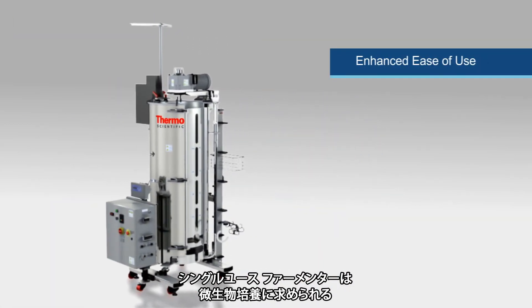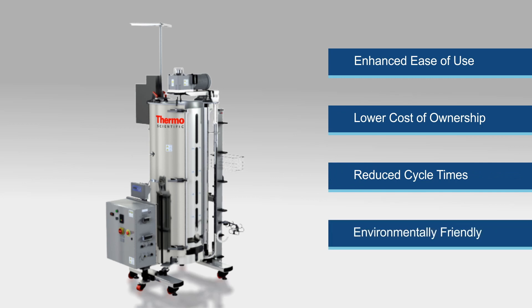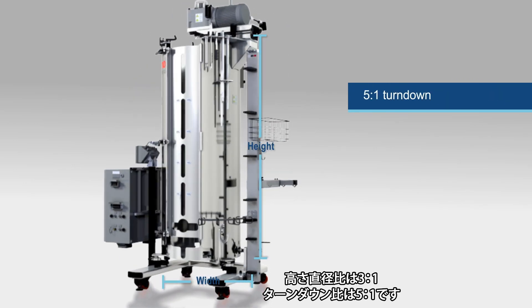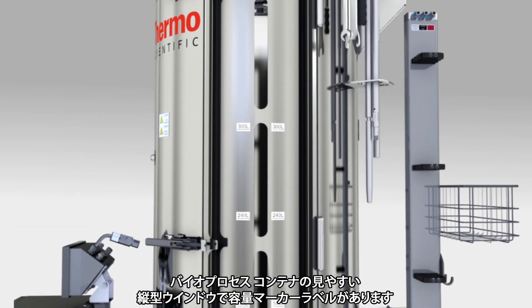The single-use fermenter has been specifically engineered to meet the vigorous requirements of microbial culture applications. Some of the key features include a 3 to 1 height to diameter ratio with a 5 to 1 turndown ratio, clearly visible volume marker labels, and a vertical window into the bioprocess container.